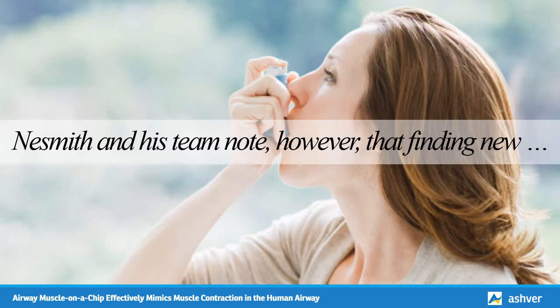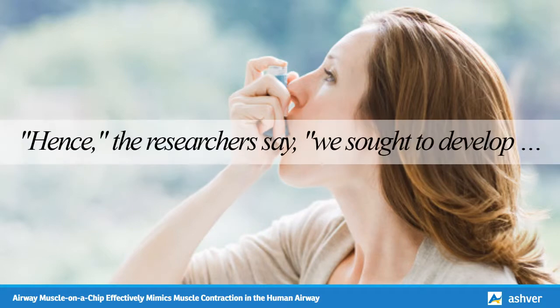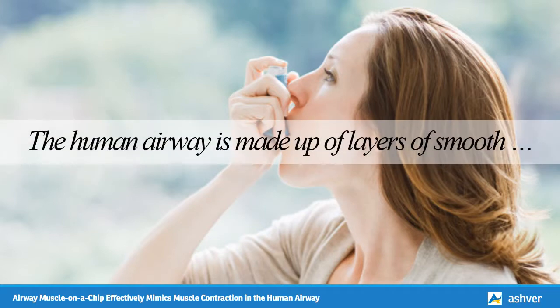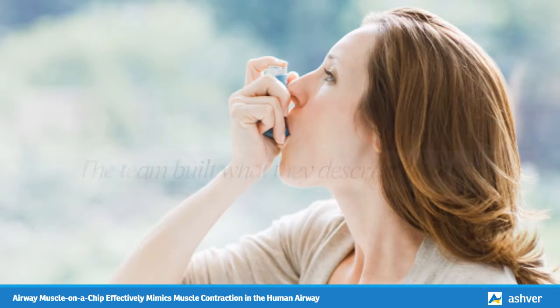Furthermore, because the disease is specific to each patient, treatments that work for one individual may not necessarily work for another. Hence, the researchers say, "we sought to develop a robust, functional, human-relevant model that can be used for screening new therapies against asthma." The human airway is made up of layers of smooth muscle that contract and relax to decrease, then increase its diameter.